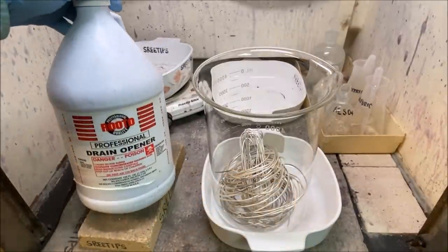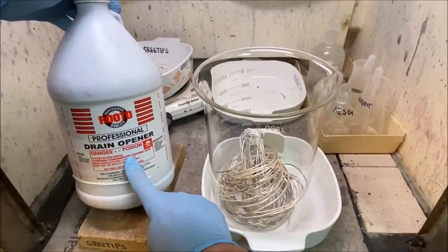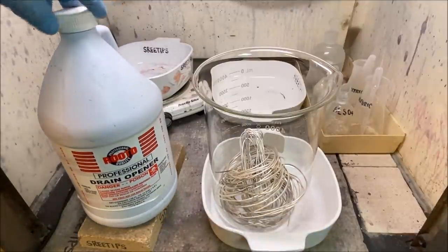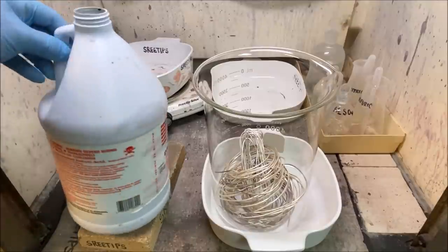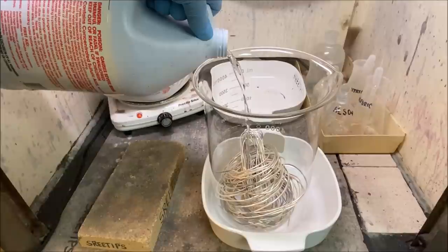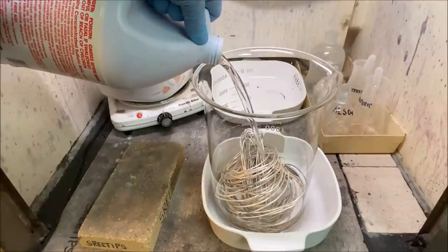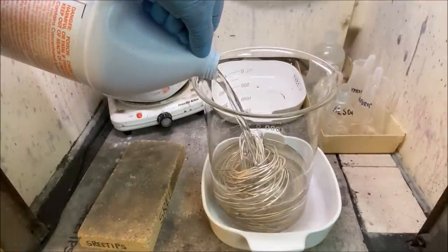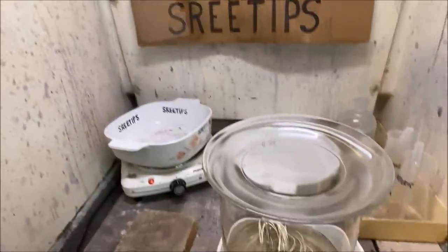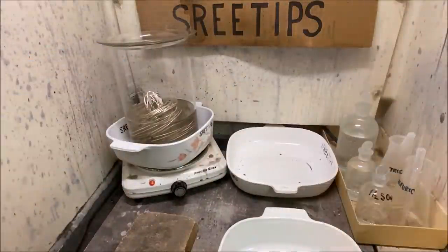What we have here is Ruto Professional Drain Opener — it's concentrated sulfuric acid, 93 percent. I bought this at Ace Hardware for $26 a gallon jug. I'm going to add that to the silver now, pouring it in carefully — the silver is still hot from burning. We'll cover this up, set it up on the heat, and start heating this up to see if we can get the silver and copper to dissolve.